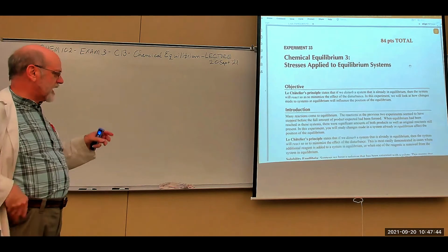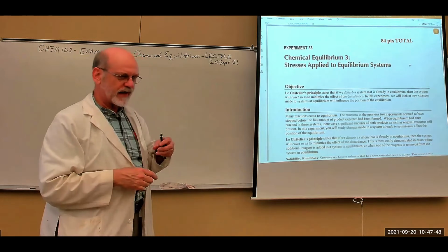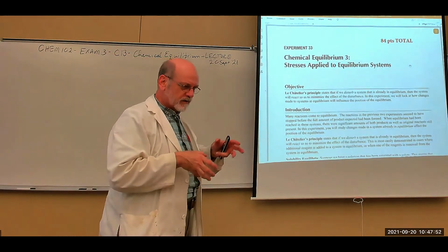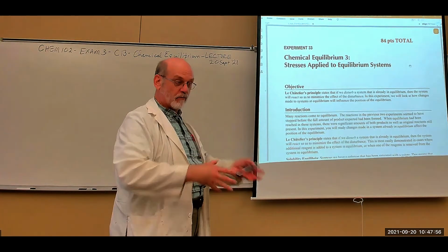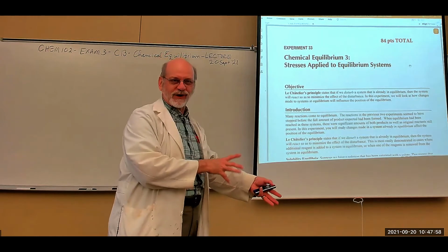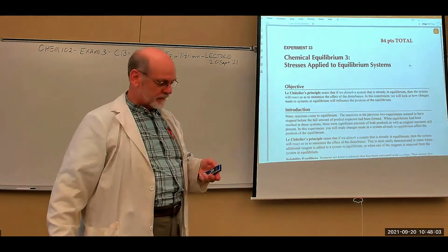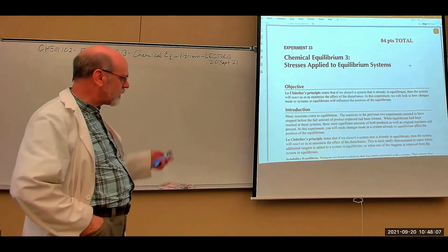So what we're going to do in this lab is investigate LeChatelier's principle. Everything you do in the lab, think of it in terms of equilibrium, disturbance, reestablish equilibrium, maybe even more disturbance, reestablish equilibrium. That should be going through your head the whole time we're doing this lab, thinking in those terms.